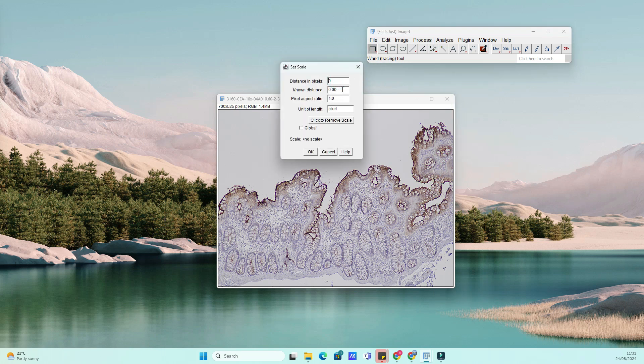Now, let's load the image that you want to add a scale bar to. Go to File, then Open, and select your image file.